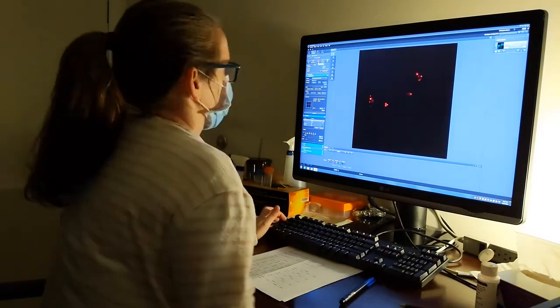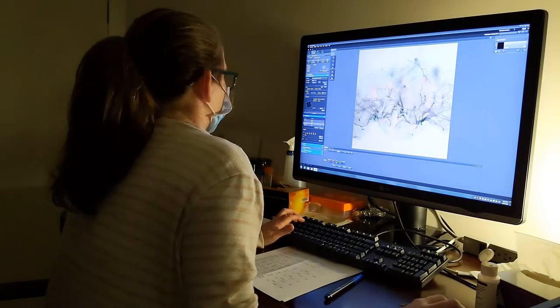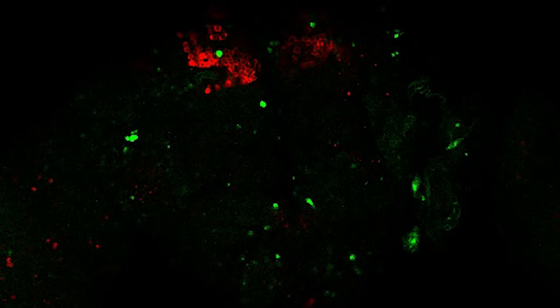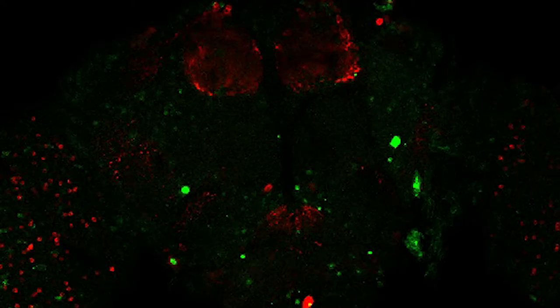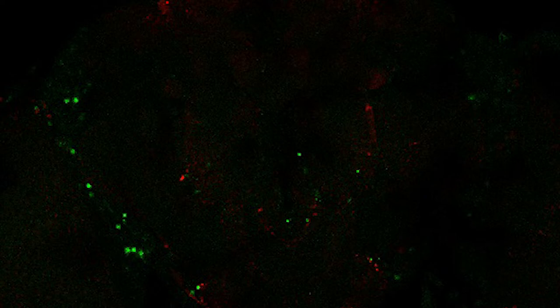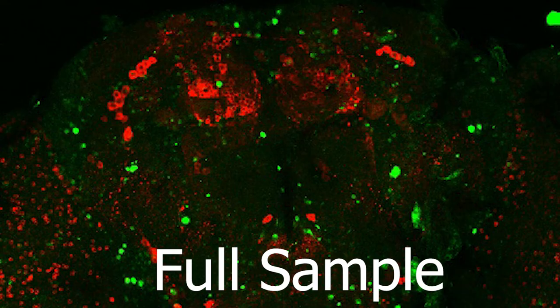This microscope works so well that it only shows you a very specific plane within your sample, so I'm now telling it exactly where the sample is and it's going to build that image plane by plane. You're going to see in red the cells that send out dopamine — dopaminergic neurons — and in green are the cells where my protein is found. Let's see if there's overlap. There are red cells that are not green and green cells that are not red. This is typical in biology but each experiment gets us a little bit closer to the answer. I've got a bunch more imaging to do, so until next time, bye-bye.